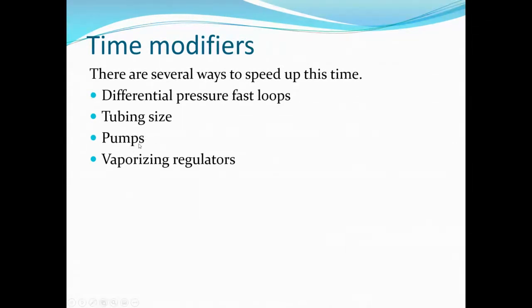Thirdly, here we have pumps. We'll talk about a different kind of pump where we can force the sample towards the analyzer with a little bit more energy. And the last option we're going to look at here is called vaporizing regulators, which in its basic form is taking a liquid sample and vaporizing it into a gas, because gases are a lot easier to transport in terms of speed.